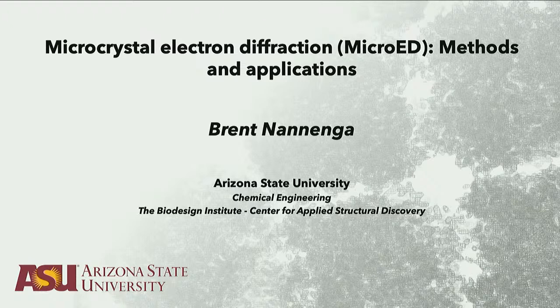When I started my postdoc, we were focused mostly on proteins because we were protein crystallographers, and now I think when I do MicroED, probably 90% of the time I'm actually doing small molecules as opposed to proteins. So I've had to learn how to do non-chiral space groups that I had no idea what those even were as a protein crystallographer. So now I have to know all 230 space groups, but it's been fun.